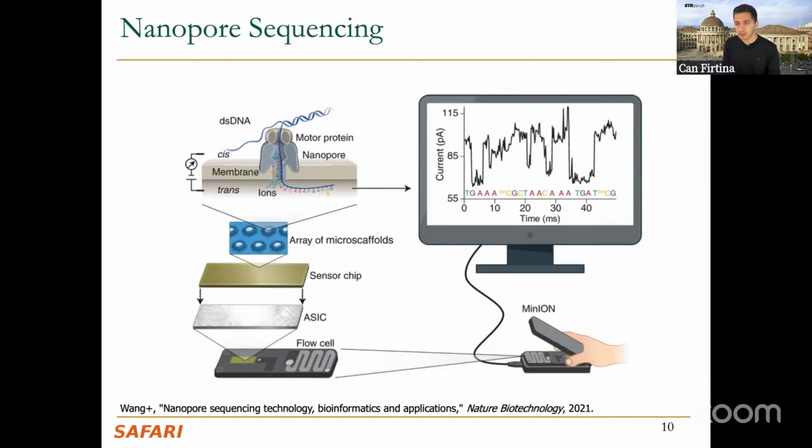I'll cover in this lecture hopefully also how Illumina works, how sequencing by synthesis works. But I'm starting with nanopore sequencing because this is something dear to my heart. But I also believe it has many unique and new opportunities that perhaps we should tackle now.